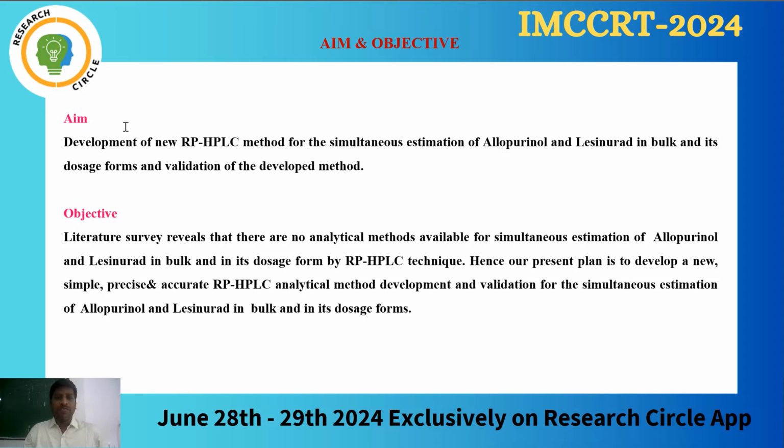So the aim of this research is to develop a reverse phase HPLC method for the simultaneous estimation of allopurinol and lesinurad in bulk and in dosage form, and we have to validate it.